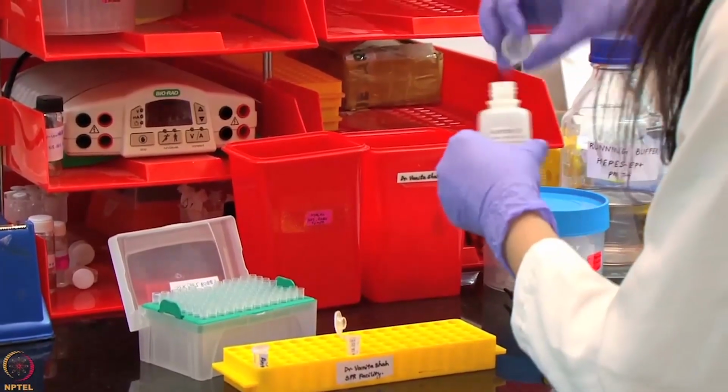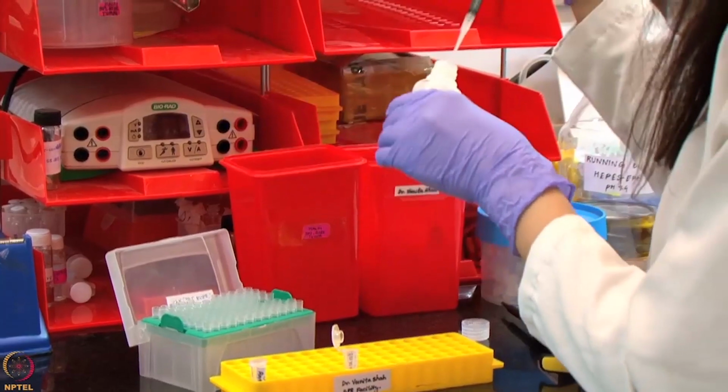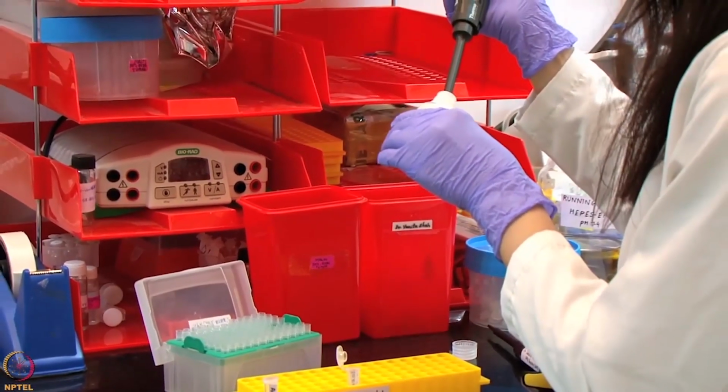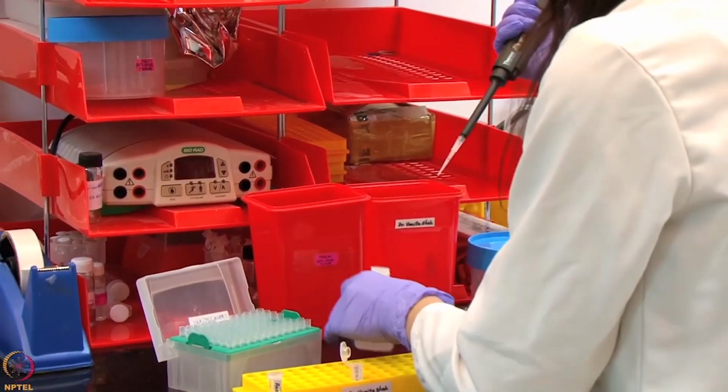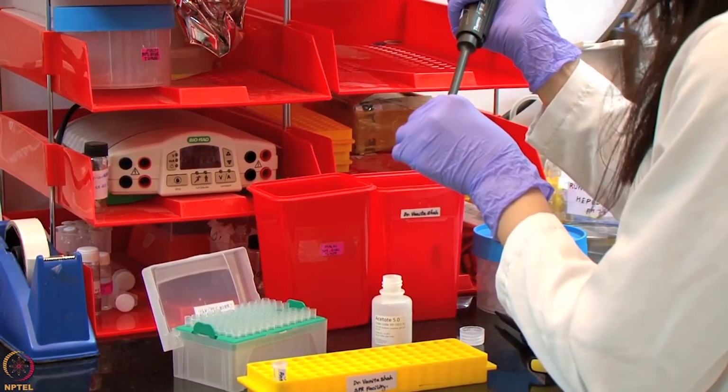The choice of the correct immobilization buffer is an important parameter to consider, and the pH scouting feature of the system can help in choosing the correct pH of the immobilization buffer.